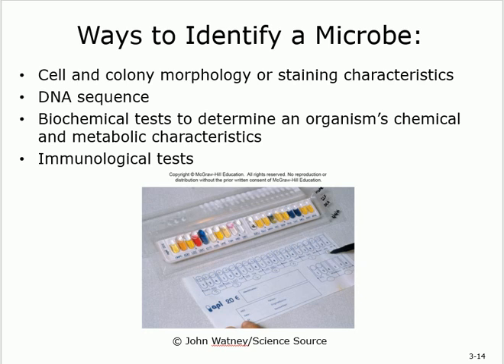You can do the morphology. Morphology means the shape. This is the first thing. Cell and colony shape. How the cell looks, how the colony looks. This is the first way, which is what we talked about. Macro and micro. In those two cases, it will give you an idea about the morphology of the colony itself, which is something that you can see. I look at the plate, and it's getting bigger, it's getting cloudy, it's white in color, for example. You call that the morphology of the colony itself. And then you look at the cell, give the details, tell me how the cell looks. This is the first way.